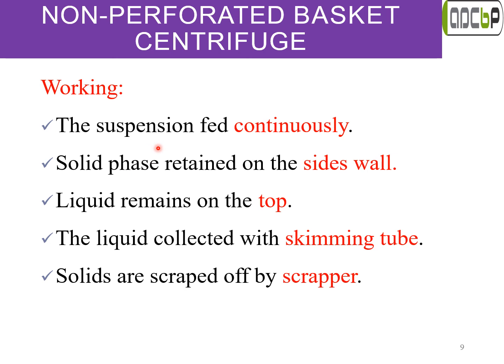During rotation, the solid phase present in a suspension or a slurry experiences centrifugal force which is higher because of the higher density of the solid than the liquid, and it gets separated or pushed toward the side wall under the centrifugal force. The liquid being less in density will remain on the top of the solid.